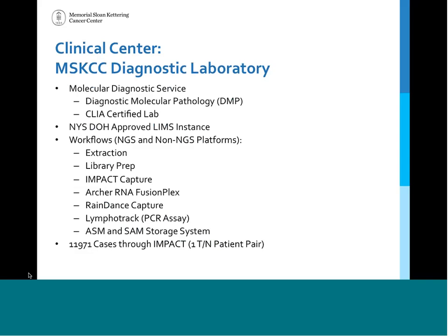Now, the counterpart to our department within the hospital is the MSKCC Diagnostic Laboratory. As part of their diagnostic service, they have a lab that is Diagnostic Molecular Pathology, also known as DMP. This is a CLIA-certified lab. So all of the samples that are processed through the DMP are actually used to affect patient treatment, to enroll people in clinical trials. This is active work on patients in real time.